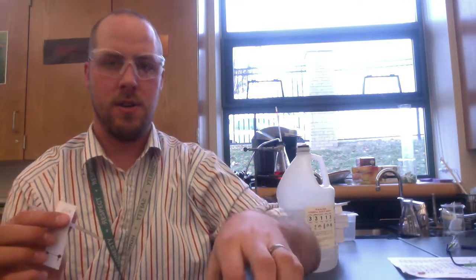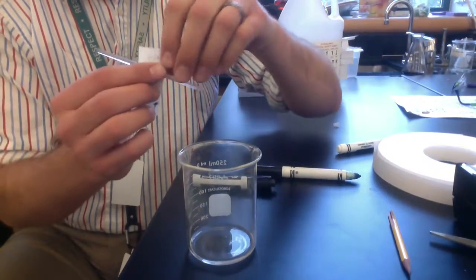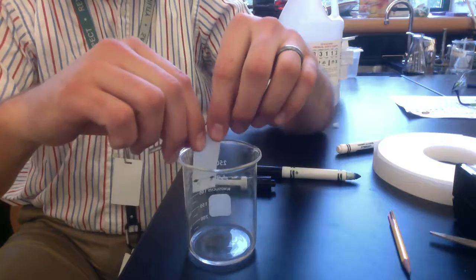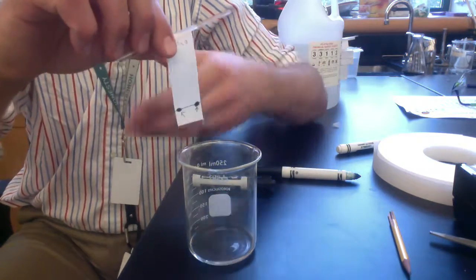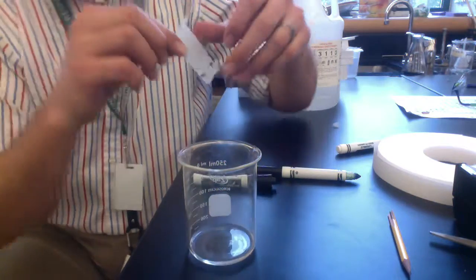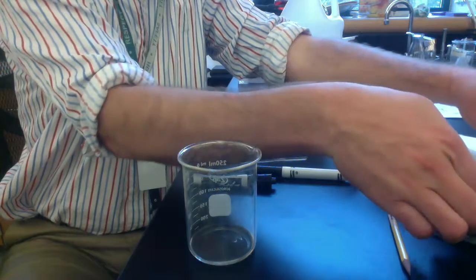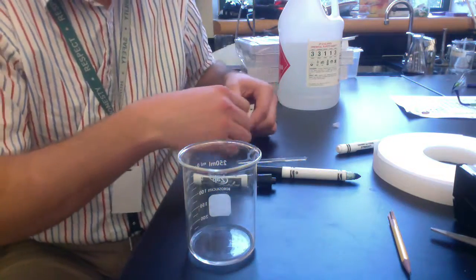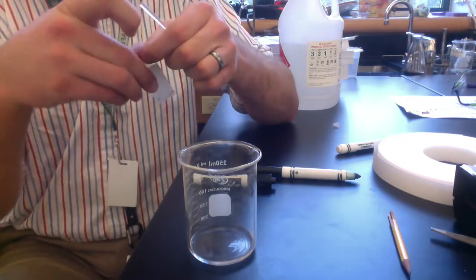What you are essentially going to do, I'm going to tilt the computer down here. You've got the beaker, and you are going to suspend your paper in the beaker so that you can let the water be drawn up the paper, and based on the properties of the inks versus the properties of the solvent, you should see some different things happen with that ink.